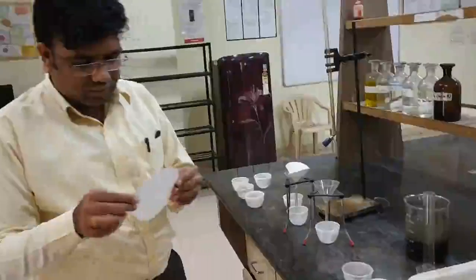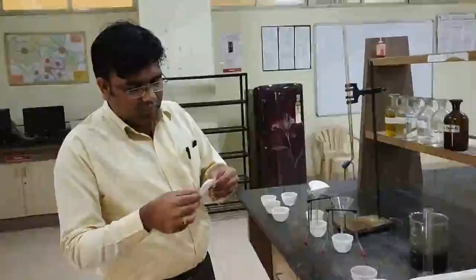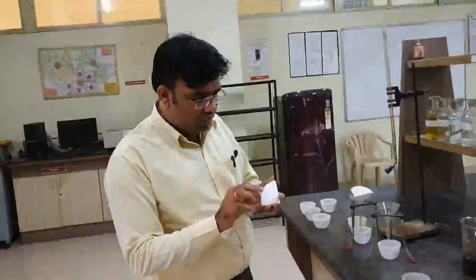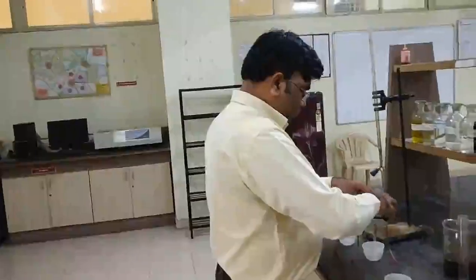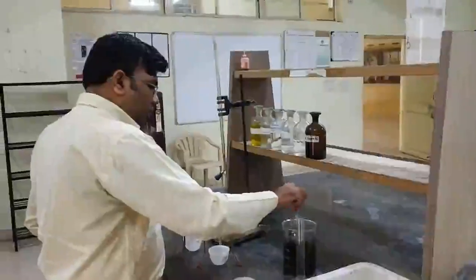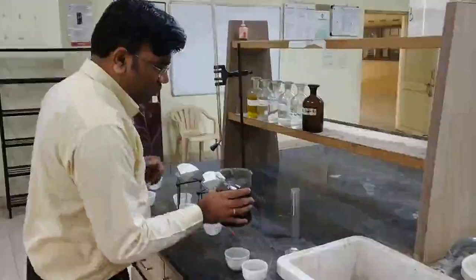Similarly, I am going to take this filter paper as well, and again quarter fold, and it will be put here properly. Now what is to be done? Again 25 ml of the sample is to be passed through this filter paper, and it is to be collected in the crucible below.